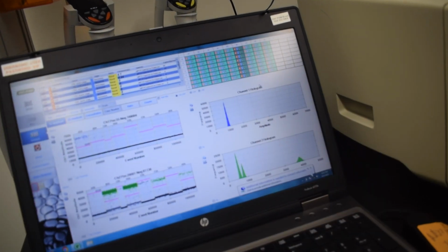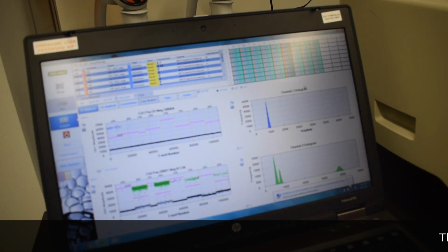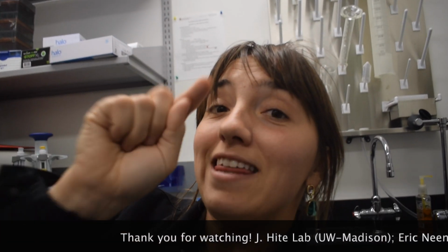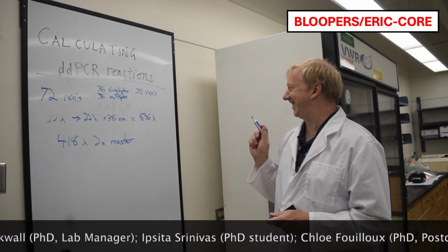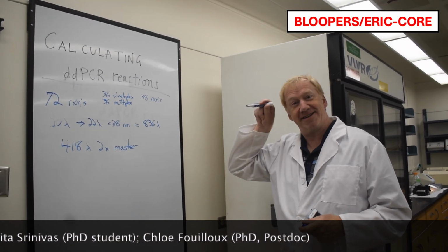We've just completed the entire run. It was better than we thought it was going to be. Yeah. That's a win. Let's go. And then I know I did it a couple of times. But then eventually I figured out that, hey, yeah, I hope you captured that. What?